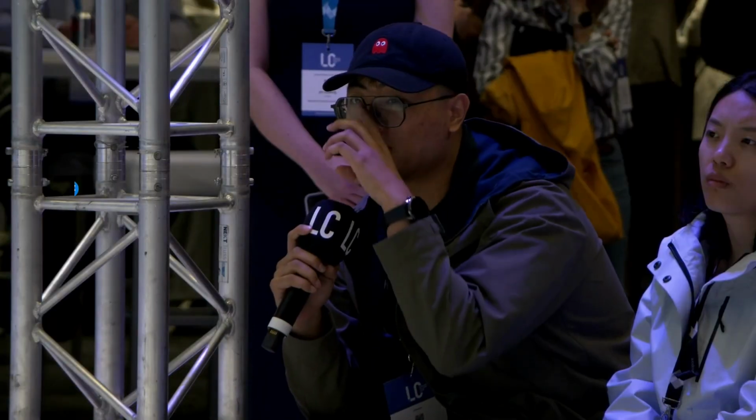Okay, thank you. Another question: I noted that there are new modification models proposed, and now we have more than 8 modification calling models. If I want to pay attention to the modification, I will run it again one by one. It's time consuming. Will it speed up in the future? I want to know.